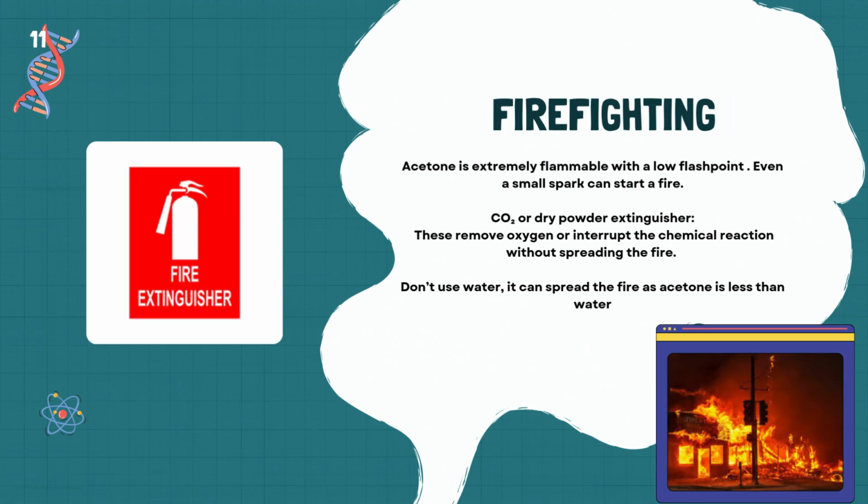Next is firefighting. Acetone is extremely flammable with a low flash point. Use a carbon dioxide or dry powder extinguisher. This removes oxygen or interrupts the chemical reaction without spreading the fire. Don't use water. It can spread the fire as acetone is less dense than water.